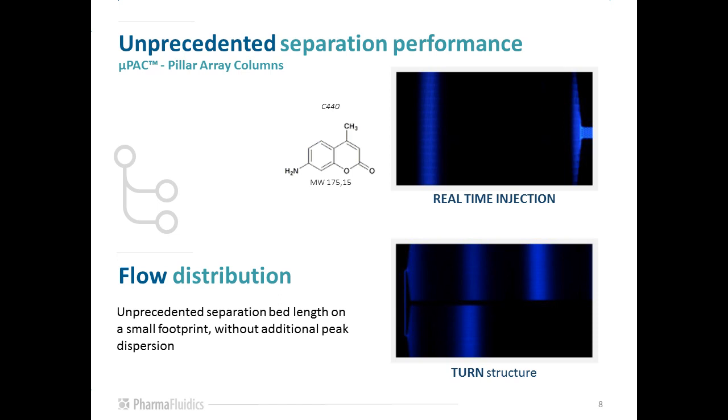It illustrates nicely how the injection is controlled by the flow distributor in order to uniformly distribute the sample over the relatively wide separation bed, and how the separated bands remain nicely straight and parallel.